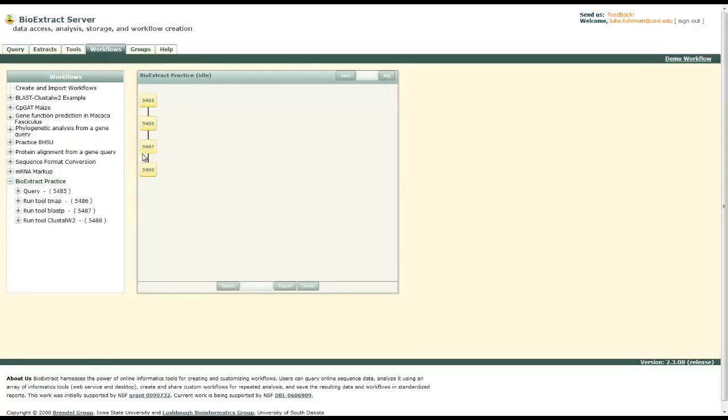So we can click it. It's on the left-hand side there. And there we have it. There's BioExtract Server.